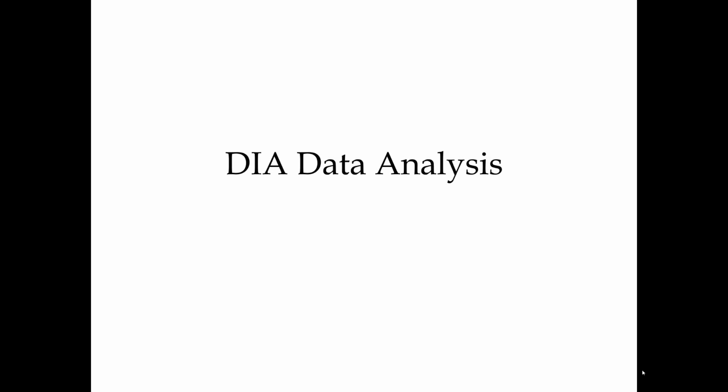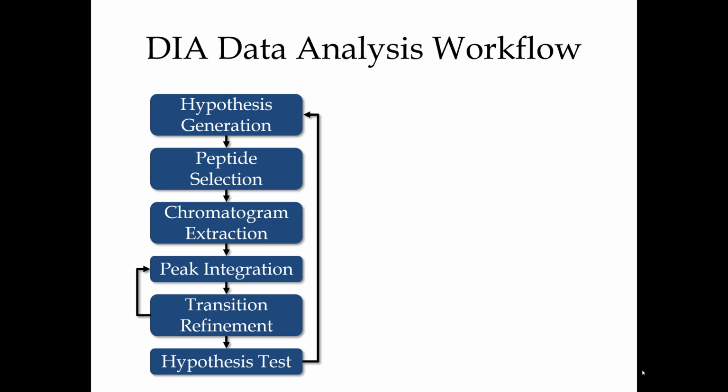All right, so an introduction to DIA data analysis. You got a fair amount from Ben yesterday, but this is a nice little schematic created by Jared Egerton in our lab, and actually in this schematic he's left off the data collection, which happens up here.